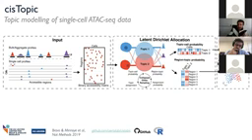So after this optimization, this yields 2 matrices. One has all the single cells and how much they like each topic, and the other matrix has all the regions in the genome, all the peaks, and how much they like each topic. So the first matrix we can use to cluster the cells, and the second to cluster the regions.